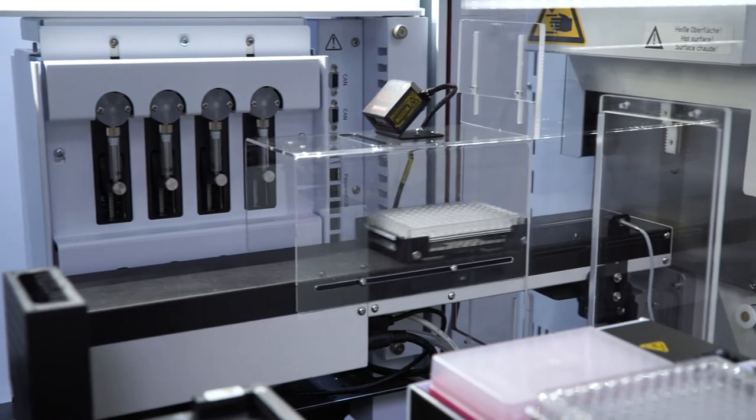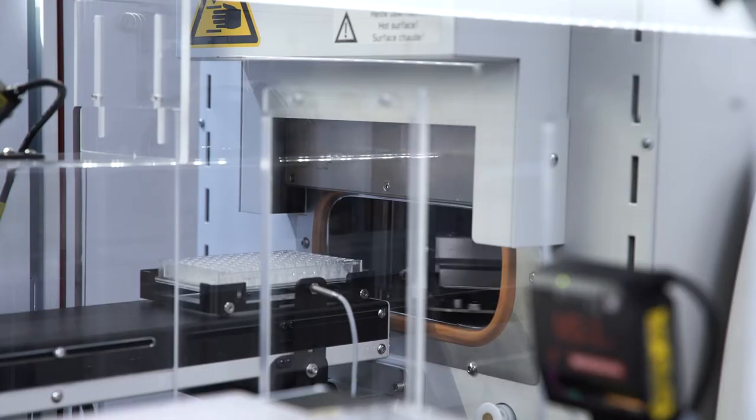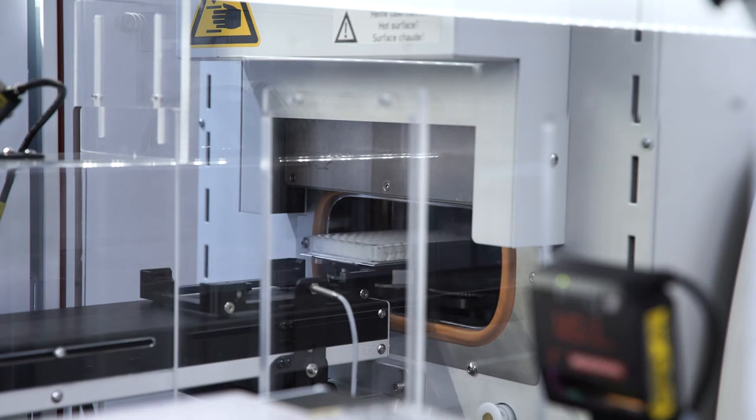The Biomech i-Series liquid handlers can access devices from all four sides, making integrations easy. This maximizes walk-away time by avoiding method interruptions.